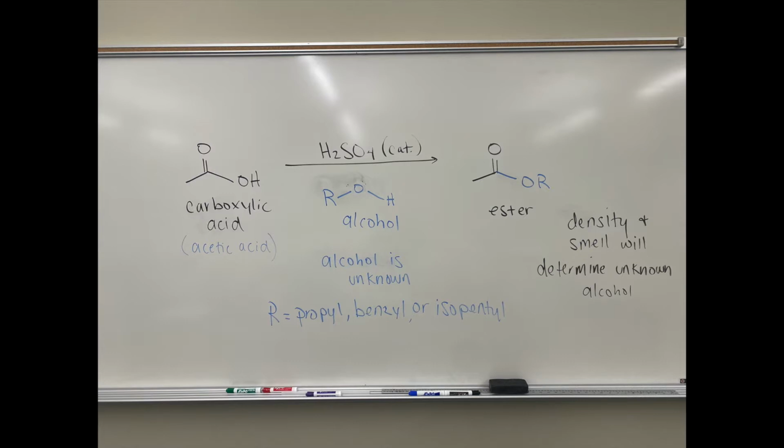And therefore, when these two compounds are catalyzed by a strong acid, in this case sulfuric acid, they will merge together to form an ester. And so you see on the ester, which is our final product, the R group is coming from the alcohol component. And based on what the ester is that you form, it will have a different smell.